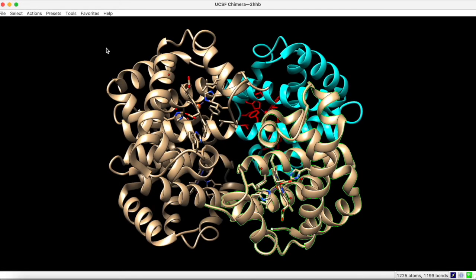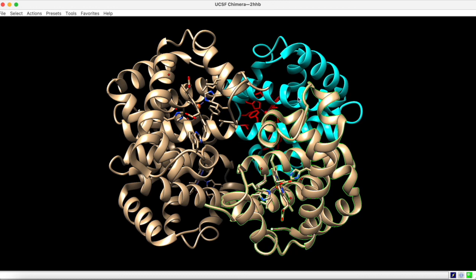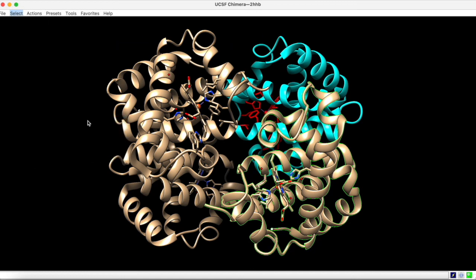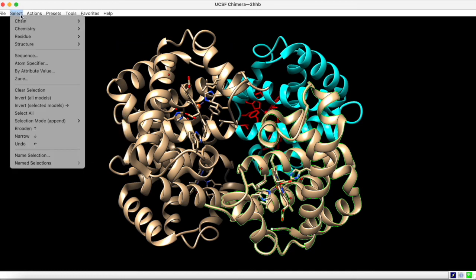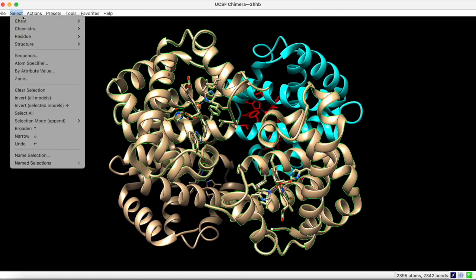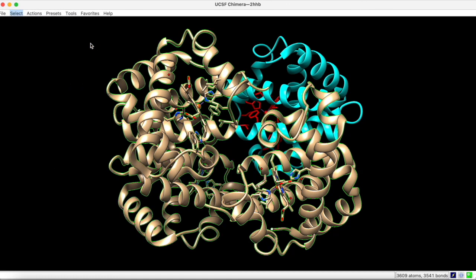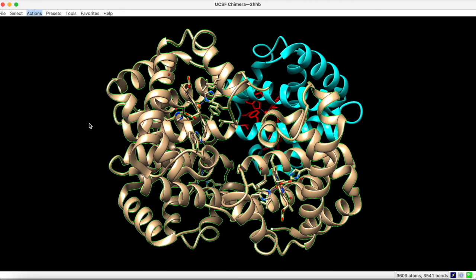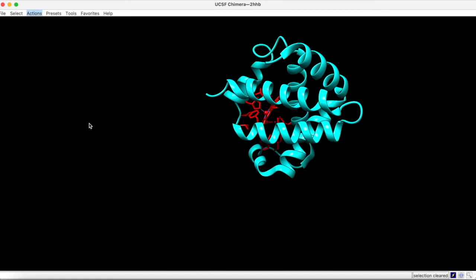Finally, it is also possible to delete parts of the structure entirely that are not relevant to your visualization. For example, let's say you wanted to delete all parts of this structure except the chain that we have previously colored. To do this, you would start by changing the selection mode to Append, and then selecting Chains C and D. Now, under Actions, Atoms and Bonds, you can choose Delete, leaving us only with the previously colored chain.